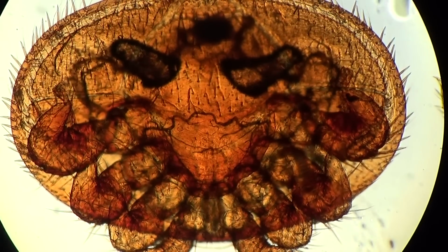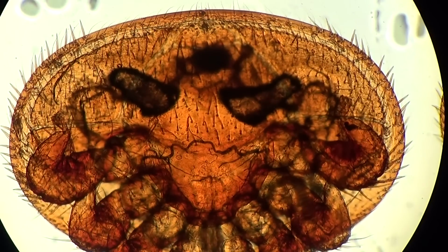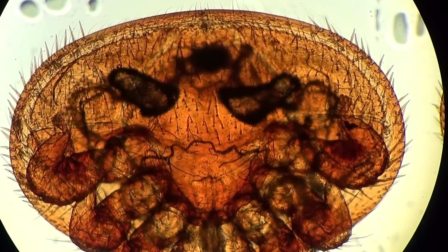Varroa mite is a very dangerous pest of honeybee, because it can reproduce only in a honeybee colony, and only in some occasional cases you can find it on other insects on flowers.